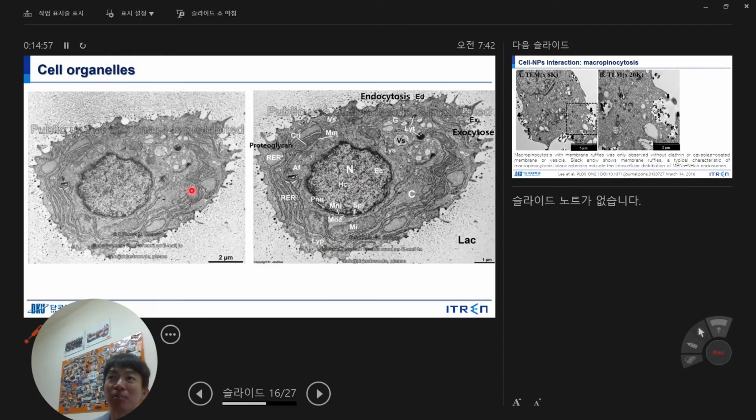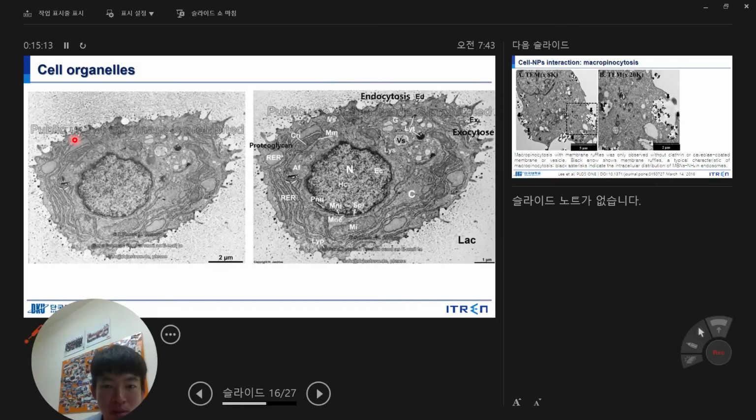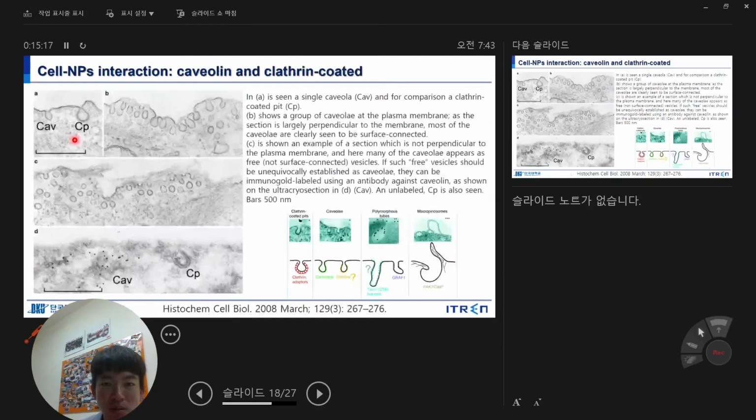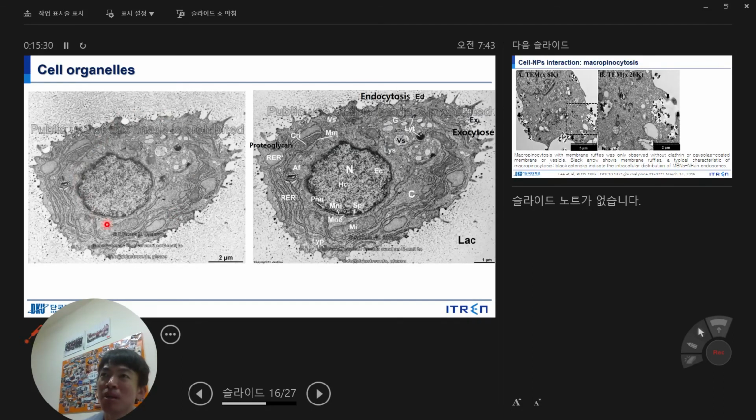Okay, this is another example. So this is the outer membrane, right? And this is relatively small. So maybe this is some example of an osteoblast. Yeah, I'll show you in detail in the cutout later. And maybe this is a chondrocyte, as a surprise member. So the nucleus and the outermost membrane, and you can see a lot of ER-like structure, right?